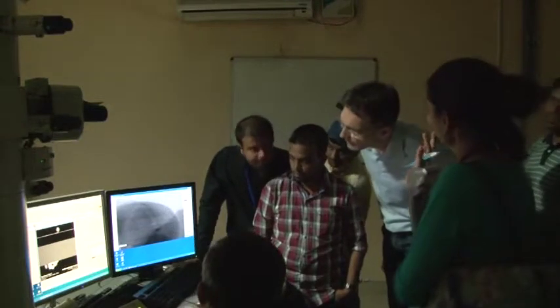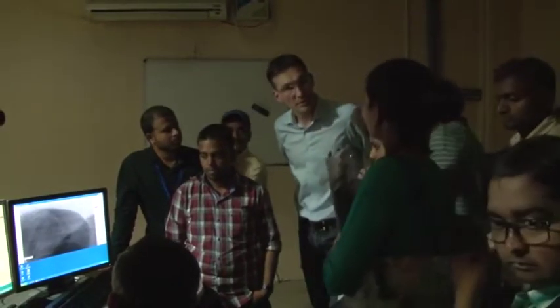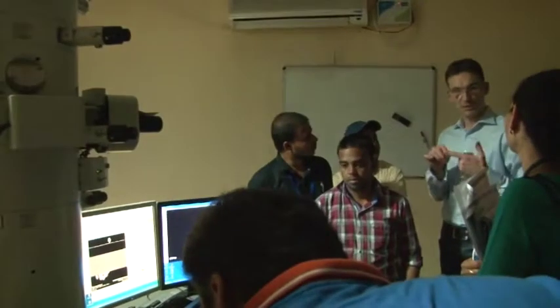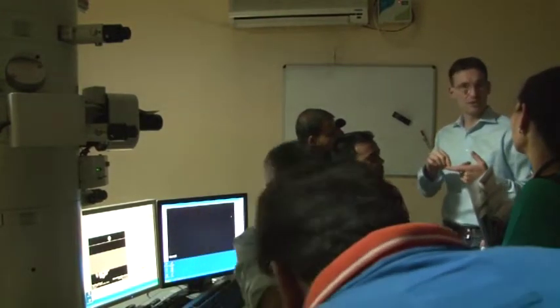But is that the only advantage of the aberration corrector? No, not the tilting. One is a better resolution. One is this delocalization effect, although this is still astigmatism, I would say, but this delocalization or these ghost images. The third one is that you know your CS value. The CS value is small, and you can use the spherical aberration correction for very specific imaging conditions.